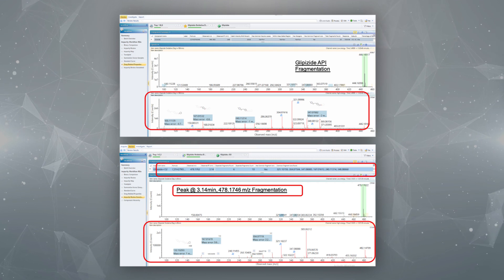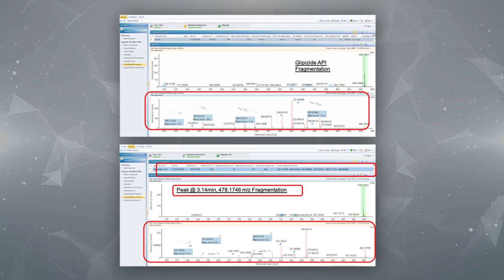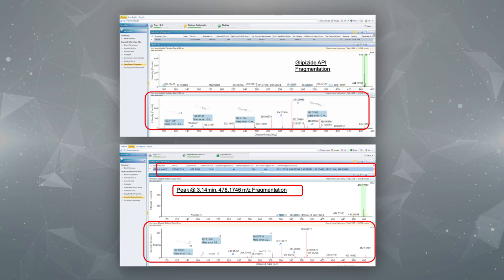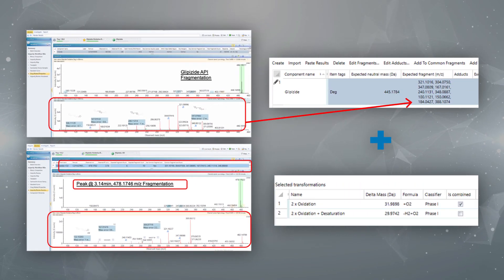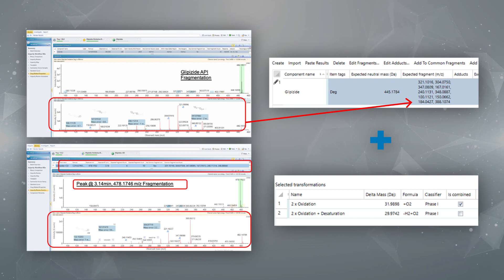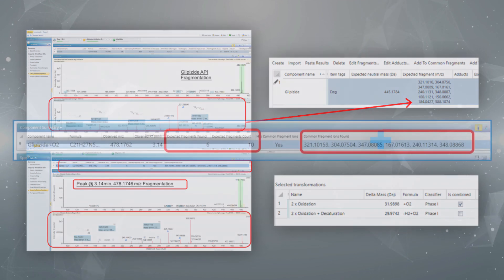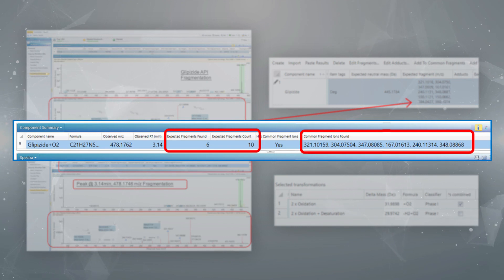It's important in pharmaceutical development when investigating an unknown peak to determine whether the detected component is derived from the parent drug. To establish a structural relationship between the suspected degradant and the API, we can import the fragment data from the API into the processing method as expected fragments. The top 10 intensity fragments have been selected along with any potential or expected transformations. The oxidatively stressed sample is then reprocessed with this additional information. We can see here that six fragment ions automatically assigned by UniFi from the structure of the API are also detected in the high energy data of the suspected degradant and visualized. The presence of six fragment ions common to both the API and the suspected degradant strongly indicates the peak is structurally related to glipizide.